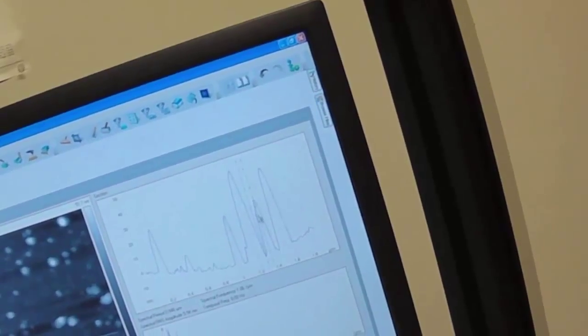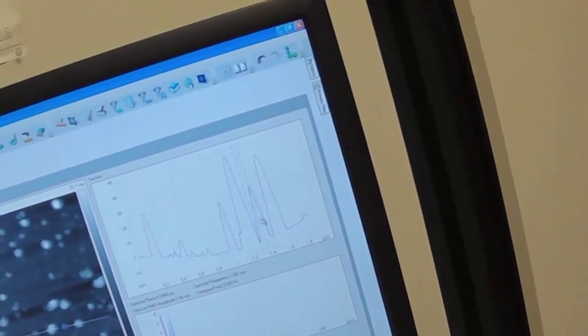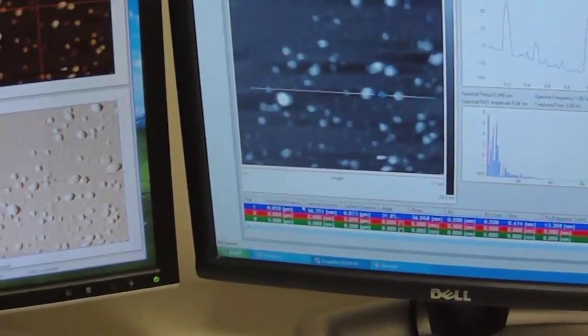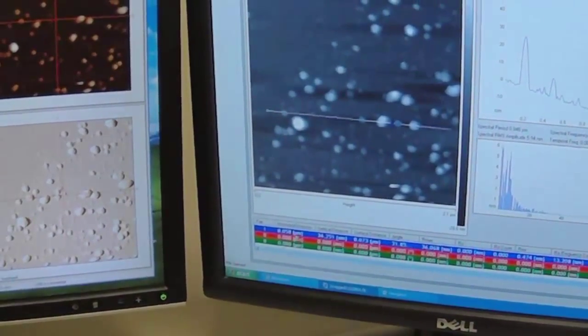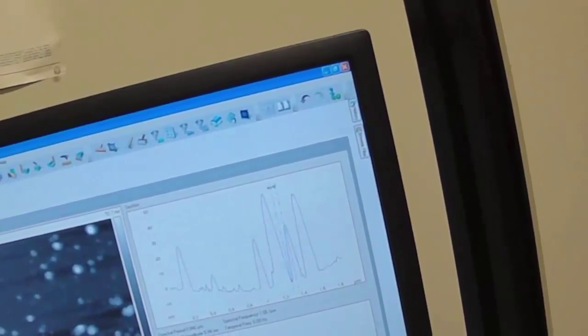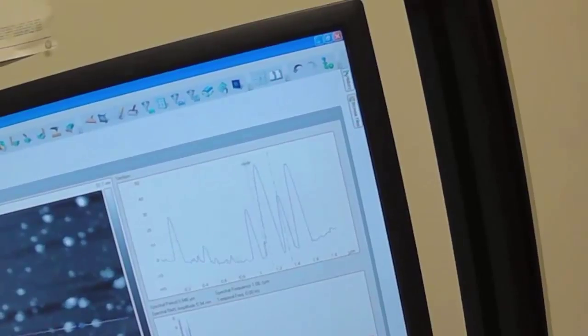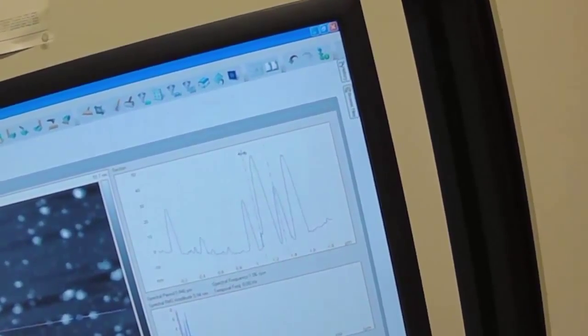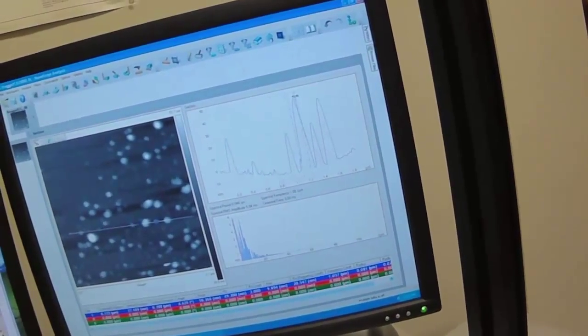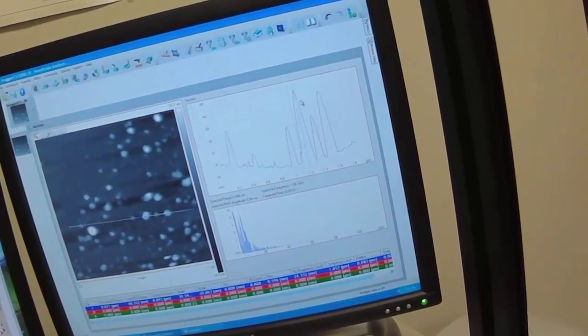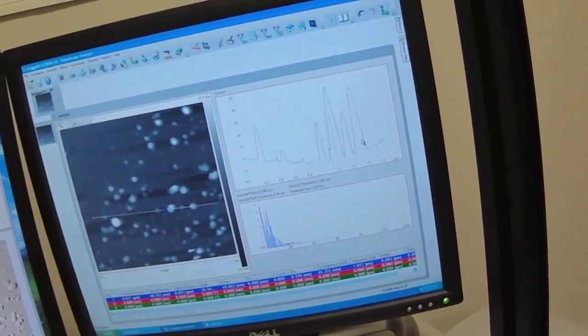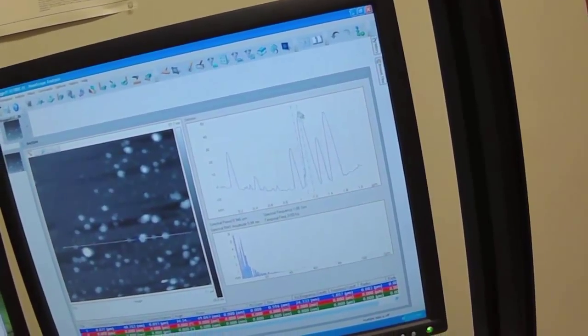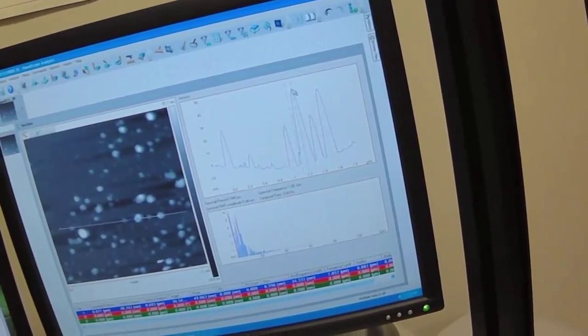You'd expect if this particle is a sphere, the height and the width should be the same. But it clearly, it clearly is not. There is some difference. And so in a post lab where you think about what that difference is due to, and I'll give you a hint, it has to do with how we are probing the surface. So we're getting a profile of the surface using a probe. So that probe only sees the surface.